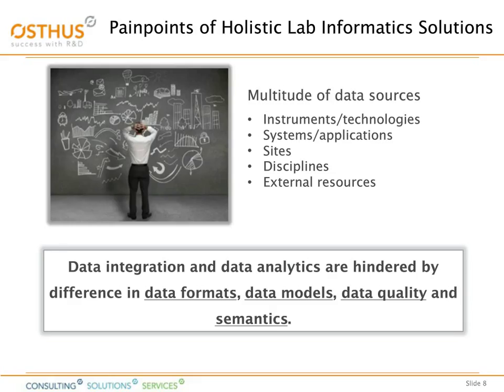Not every company is willing to use the same vendor for its platform. The data standard will have to be vendor agnostic and neutral to facilitate communication between different companies.